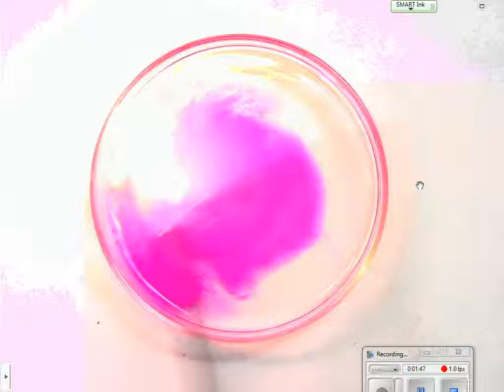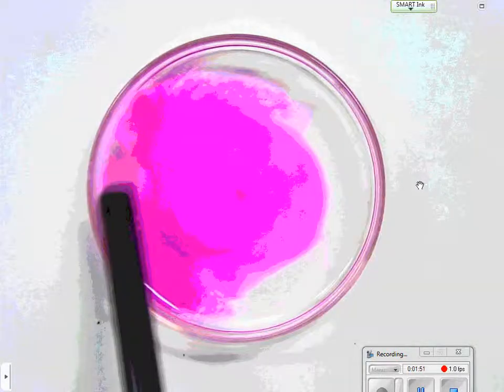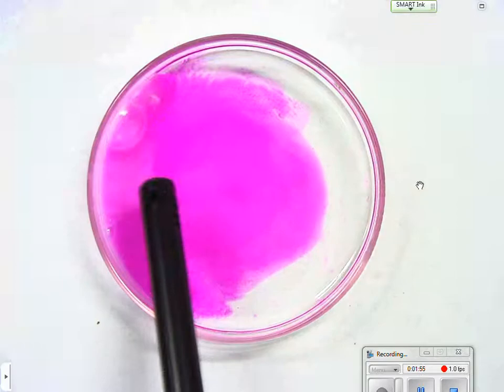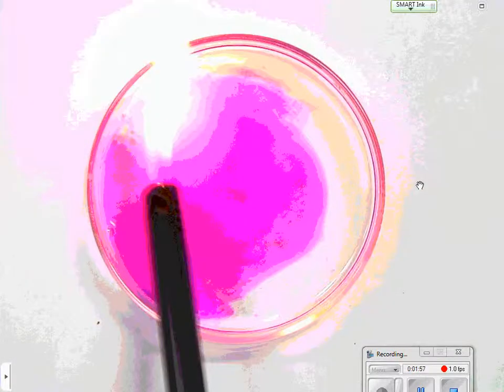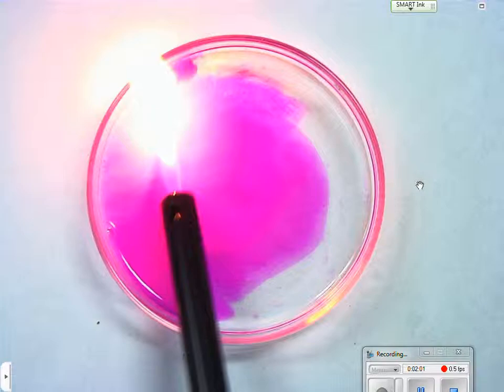Oh, did you hear that? Listen carefully. Watch the flame in the video. See it popping? See? Oh, look at that.